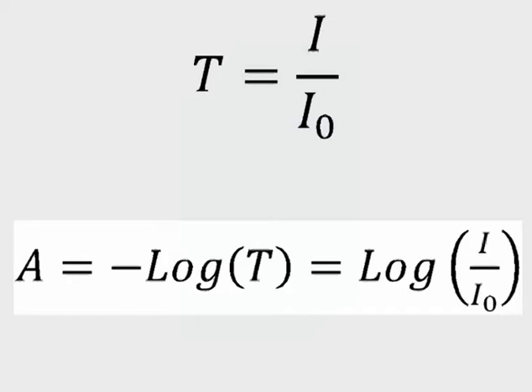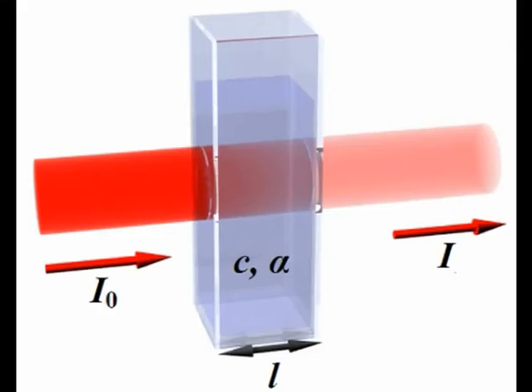A. Scattering losses in the solution. B. Reflection losses at the interface. C. Reflection losses by the big molecules. And D. Absorption by the container walls. So, we need an equation to describe it, an equation that considers the losses mentioned. This equation is called Beer law.